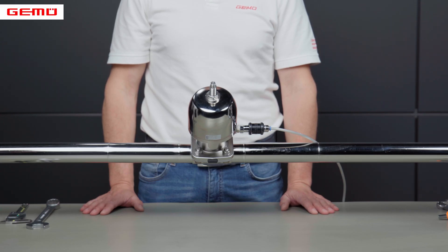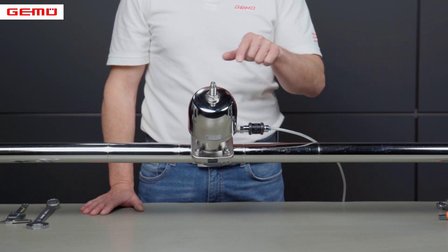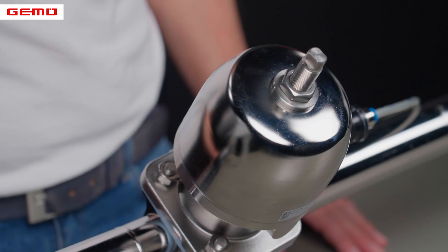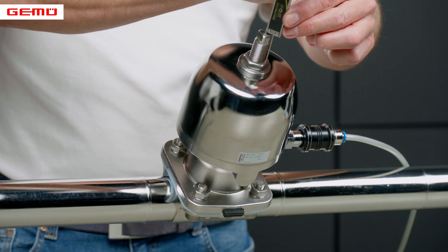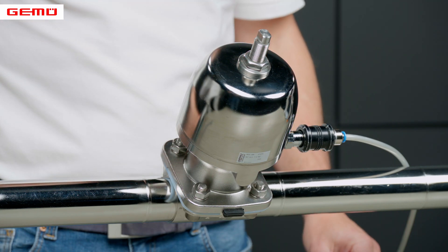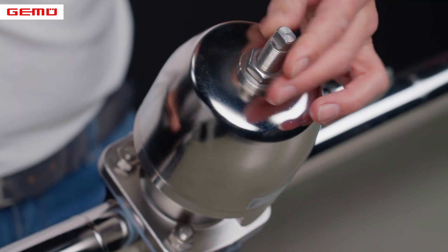Various optional accessories can be fitted, such as a stroke limiter. This must be removed before replacing a diaphragm. Before removal, we advise that you measure the installation length of the opening limiter as a point of reference to facilitate subsequent refitting. Now undo the lock nut using an appropriate tool and dismantle the opening limiter.